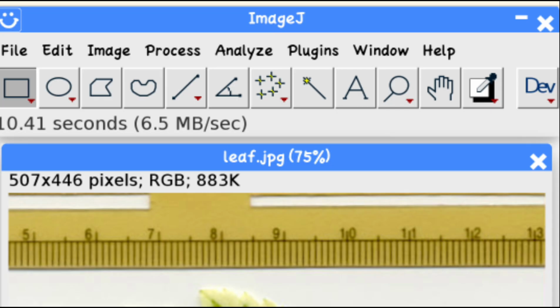We can select a foreground and background color for the image, and there is a customize tool action icon that remains at the rightmost corner. The shape and drop-down arrows are customizable slots for running specific plugins, macros, or developing tools.